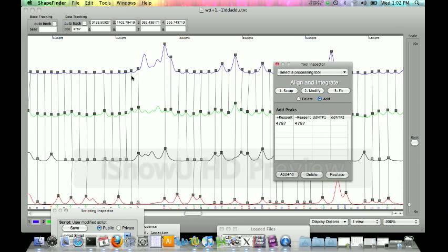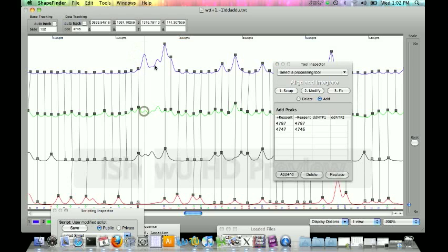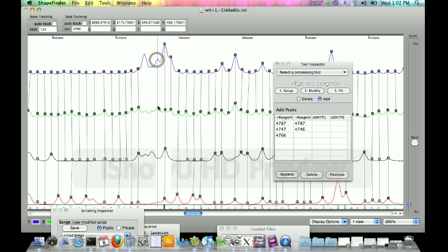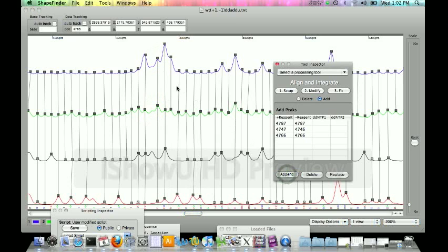Just like you can delete more than one peak at a time, you can also add more than one peak at a time. So I'm going to go ahead and add a peak back in here and add one back in here. As you can see, the first peak that it added here isn't necessarily right on top of the peak.